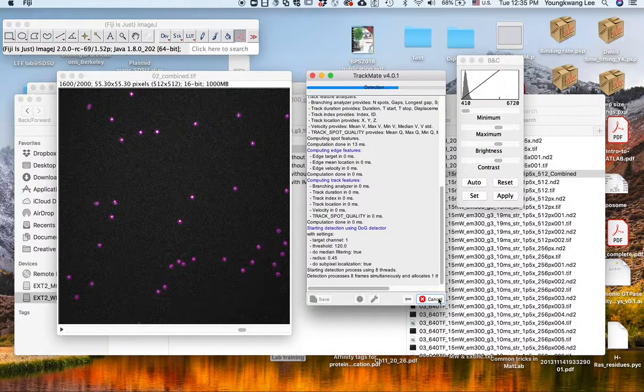But if you use MATLAB, you just type everything as one: pixel width, height, depth, and 1 second, because in MATLAB we have a user input that can define the pixel dimension and time scale, and also the region of interest. We can do a lot more in MATLAB. But for this demonstration, I will use only Igor. Actually, this is the method I used most for my previous publications. So let's start with the simple tutorial with this, and then we will also work with MATLAB.